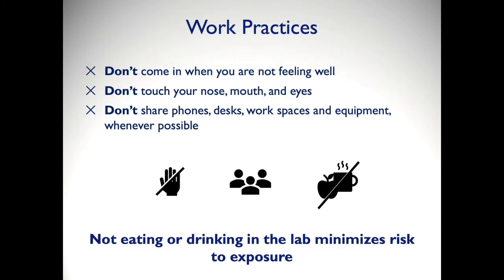In the same vein, don't come in when you are not feeling well. Don't touch your nose, mouth, and eyes. Don't share phones, desks, workspaces, and equipment whenever possible. Not eating or drinking in the lab minimizes risk of exposure.